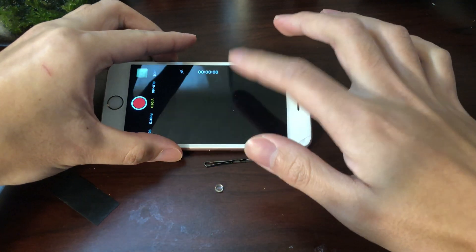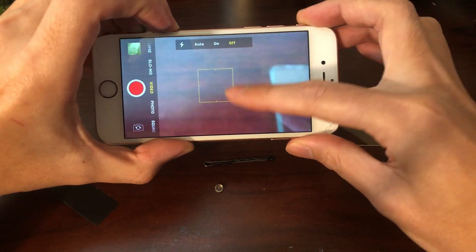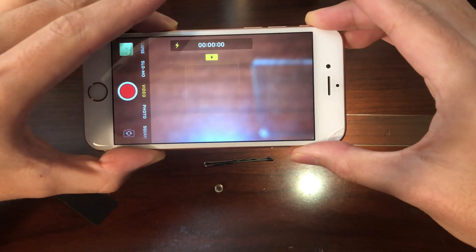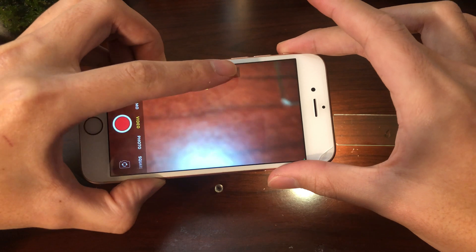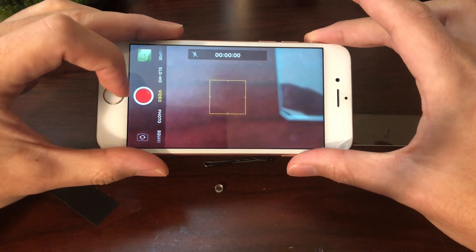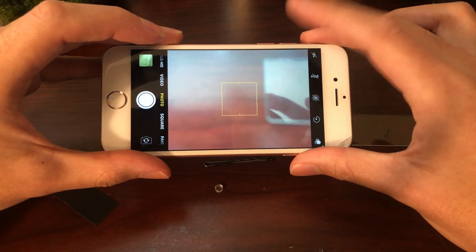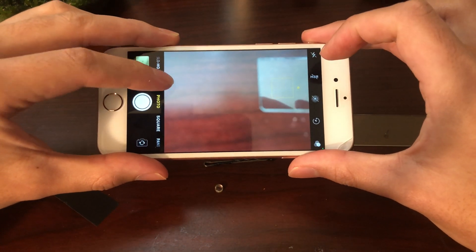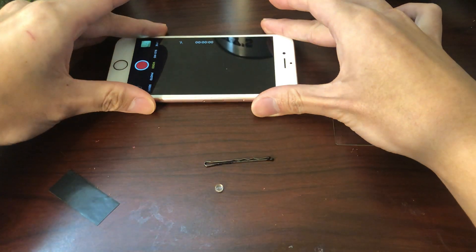Lastly we're going to need a phone with video capabilities, and your video has to be able to keep the flash on without turning it off. Make sure you are in video mode — if you have an iPhone, for photos it's a little different because you can't keep the flash on in photo mode. So make sure you're in video mode when you're doing this.